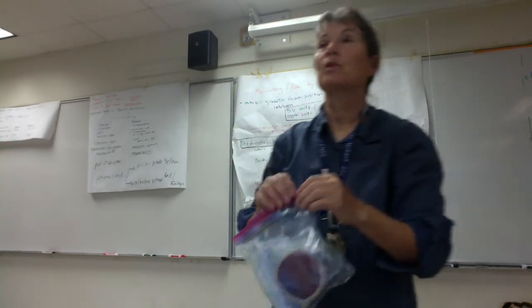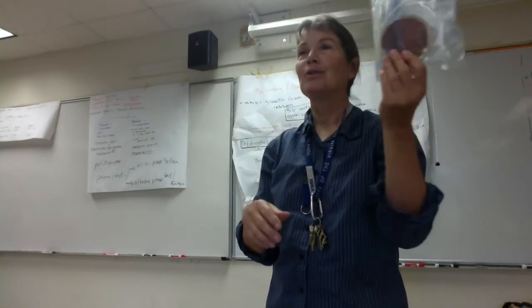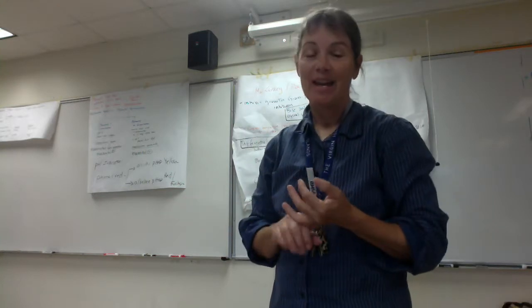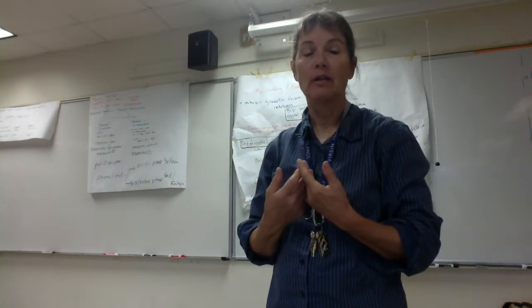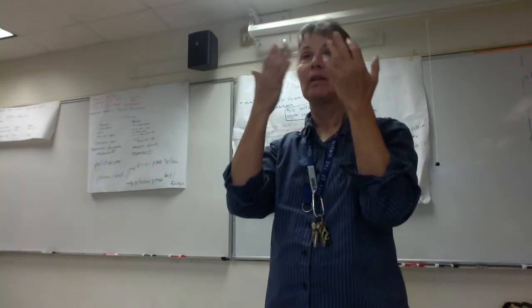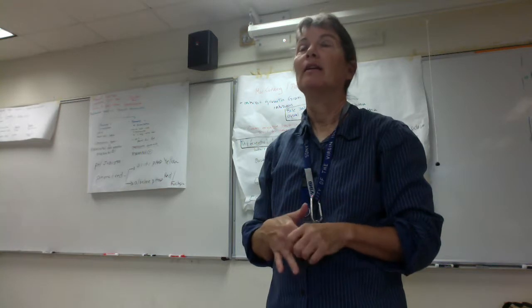And certainly, folks, when you're finished, even, I mean, I'm uber cautious about this stuff. As soon as you even just look at them here, make sure you wash your hands. And because, folks, we do have Strep pyogenes here in Lillard Hall, try to keep your hands away from your face, because that's a great way for them to gain access. And try to wash your hands as frequently as you can.